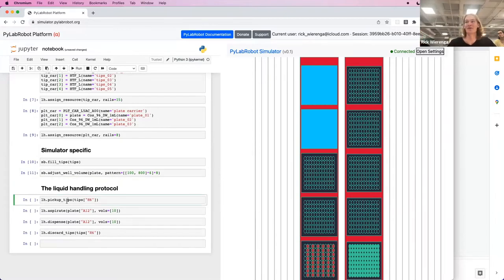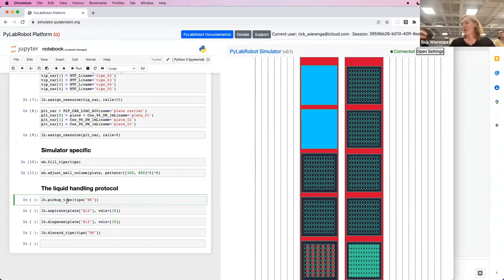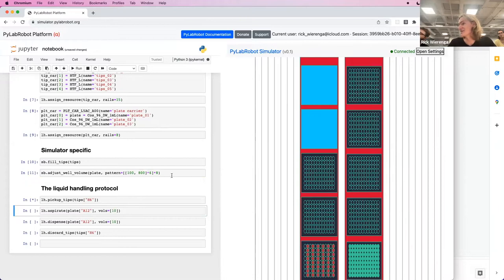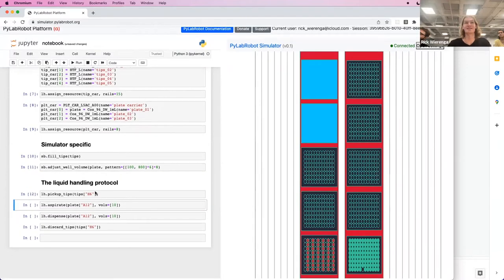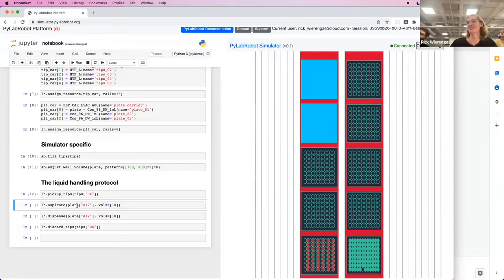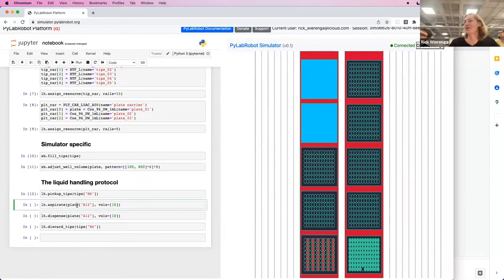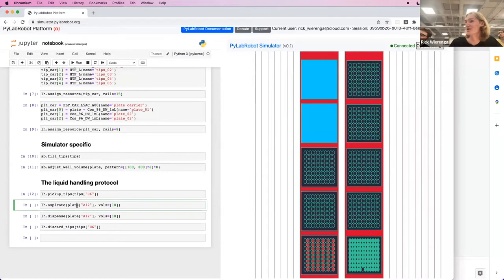And then for the liquid handling protocol, we want to pick up a tip from tip H6, which as you can see, takes a little while, just like it would in a real robot to sort of represent reality. You can turn this off if you are in a rush.